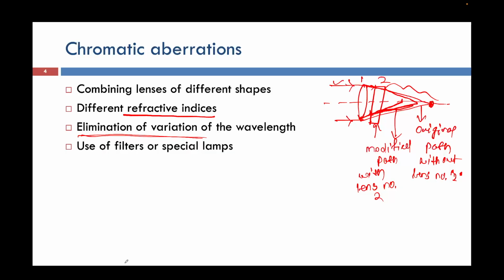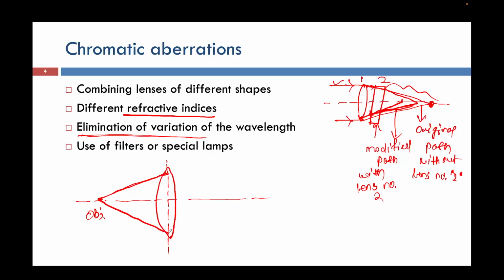Whenever I have drawn an object here, you must have seen that all the time, I have assumed this lens to be perfect. Perfect means whenever I needed some refraction, I have done the refraction from this optic axis and from the lens axis, right?